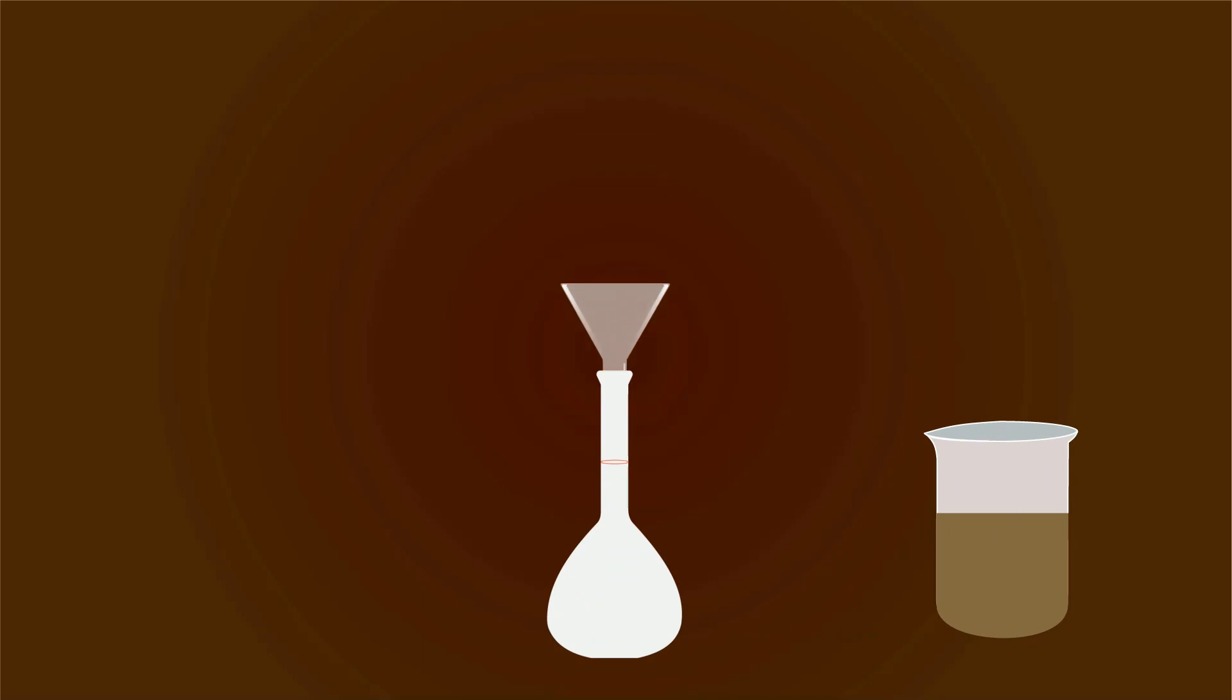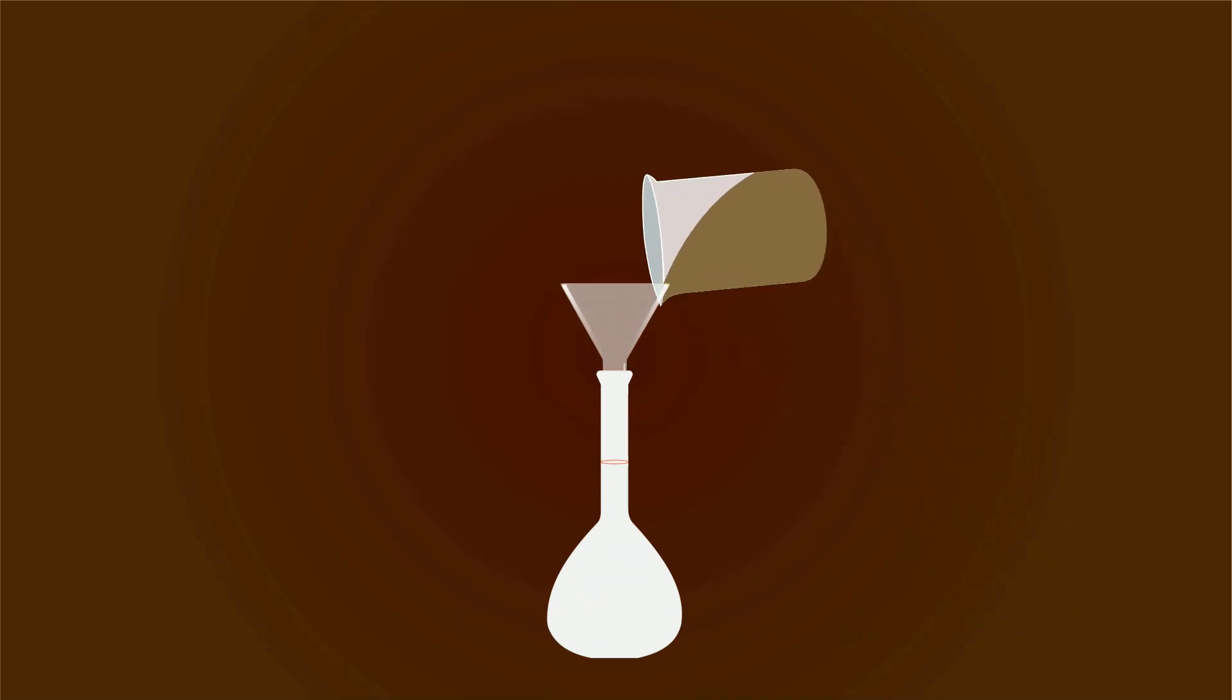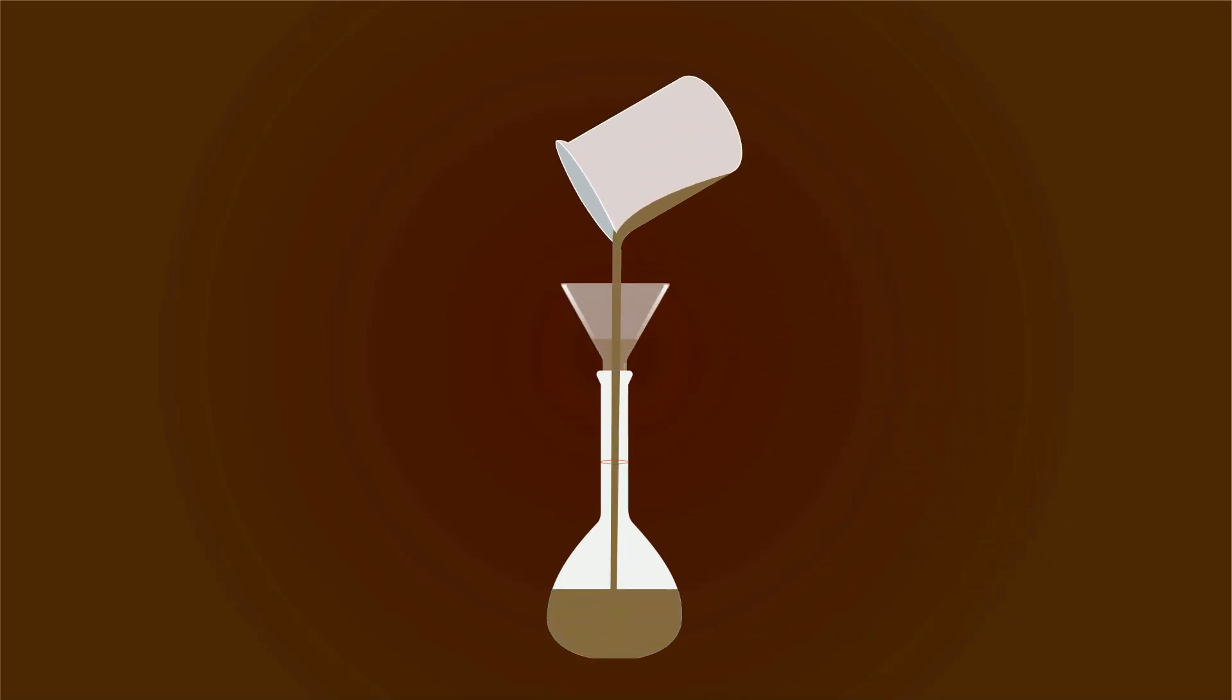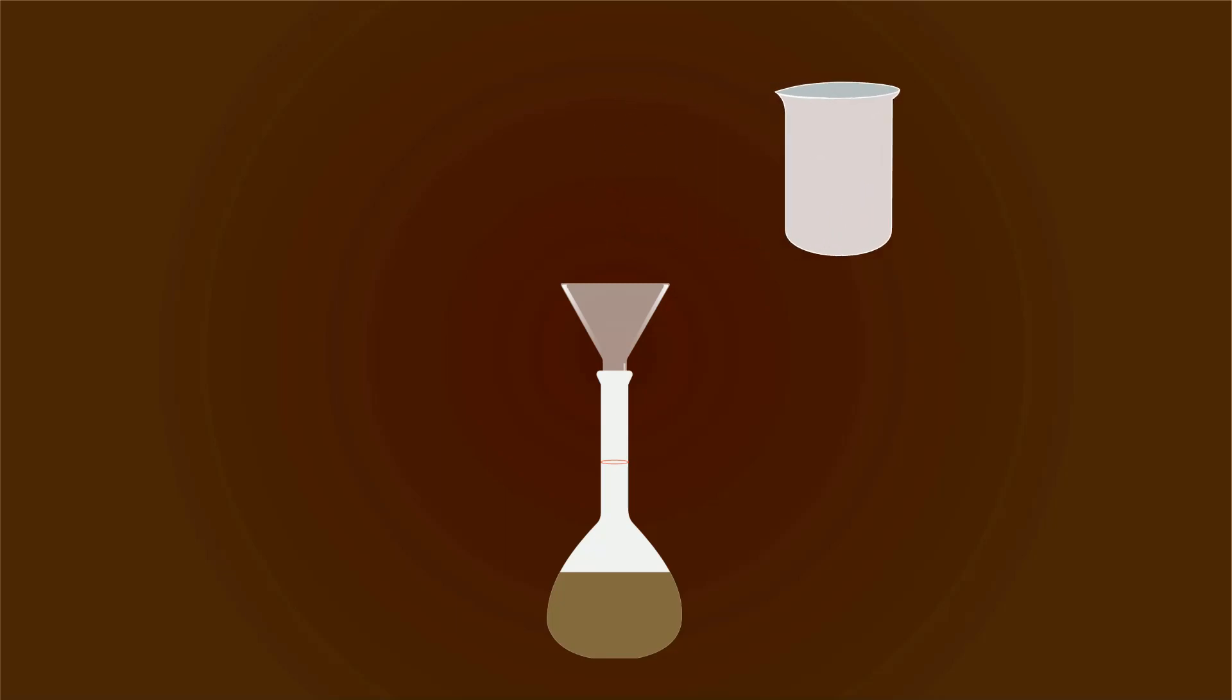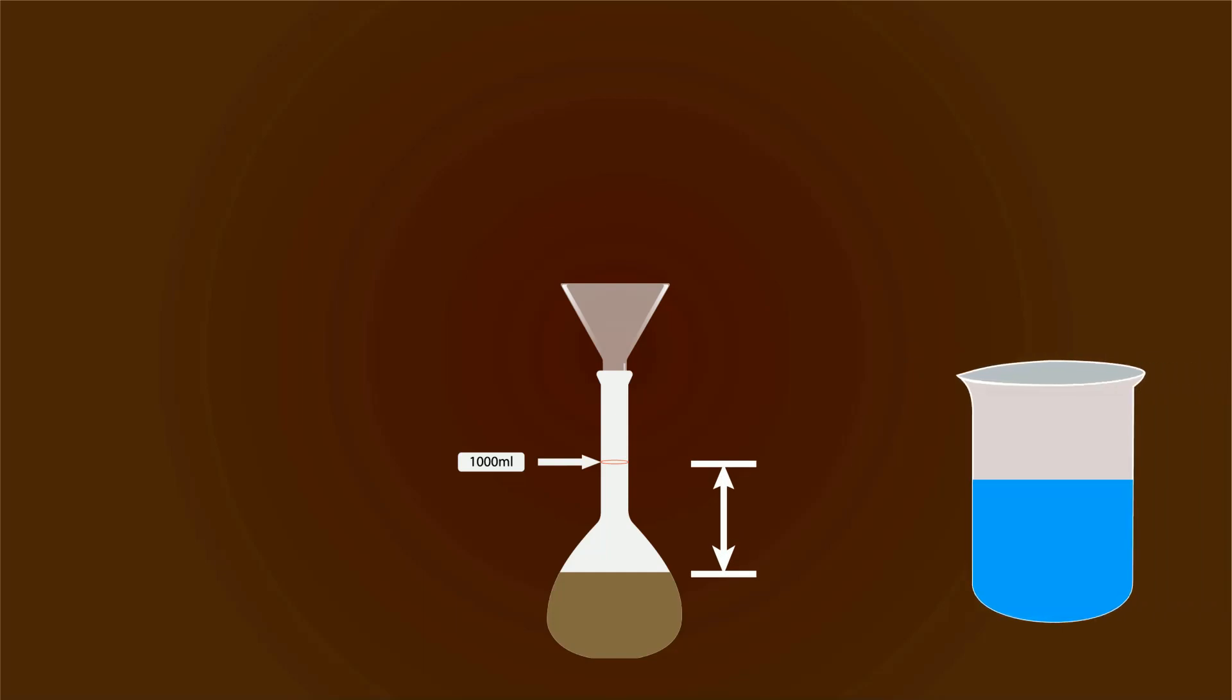Now add this mixture into the 1000 milliliters volumetric flask with the help of a funnel. You can clearly see the 1000 milliliters point. To get 0.1 molar we have to fill it with more distilled water up to the 1000 milliliters point.